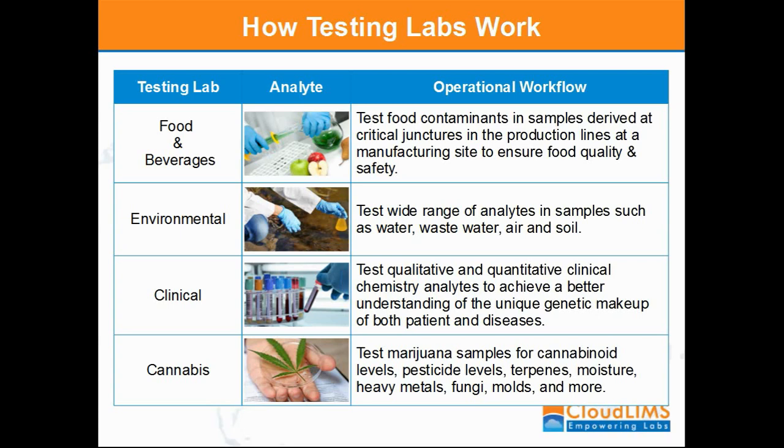Similarly, the environmental testing labs test for a wide range of analytes in samples such as water, wastewater, air, and soil. Due to the rapid industrialization across the world, several environmental threats continue to evolve. Before discharging industrial effluents into the surface water, they must be properly treated in accordance with state regulations. Analyzing contaminants or identifying hazards in the environment can help labs suggest corrective actions on time and thus minimize health risks.